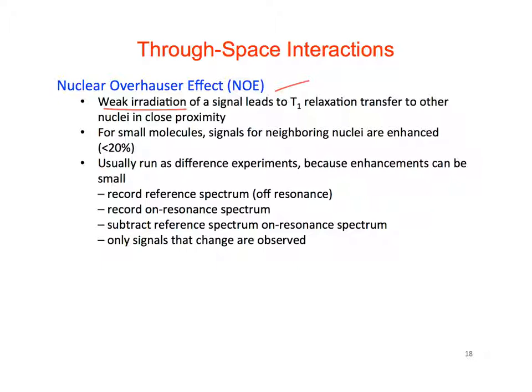In this one, we irradiate during the pre-acquisition. So that's that delay before the pulse. And then we usually turn off the decoupler during acquisition because we're not trying to actually decouple it.